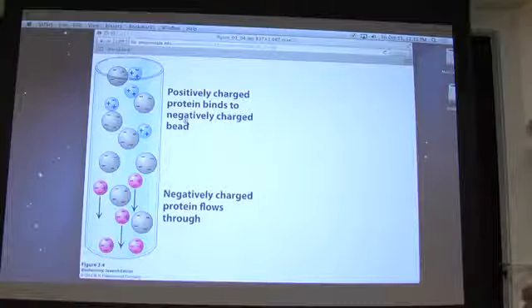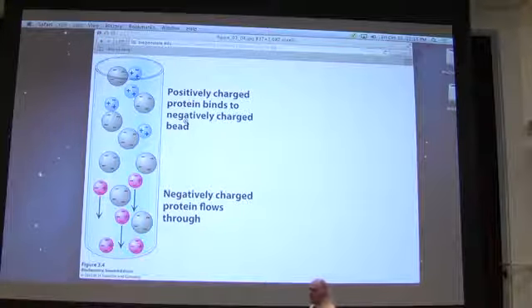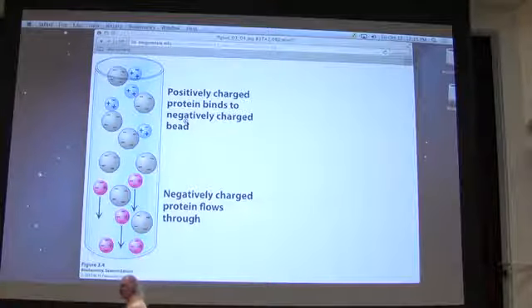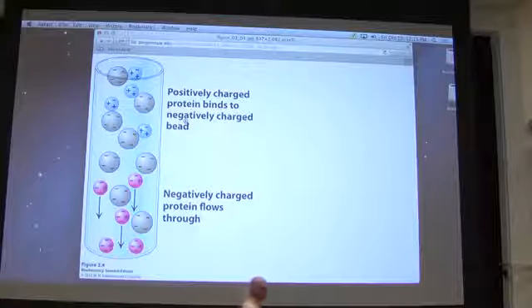Now, wherever we have a charge, we have to have a counter ion. You can see this set of beads all has a charge of negative. When we started out with this bead, it wasn't negative. It had a sodium ion or a potassium ion as a counter ion, so that its overall charge was 0, right? We always have to have a counter ion. We don't have these charges just by themselves when we pour something into a tube. So we had a counter ion, a sodium or a potassium that was positively charged.